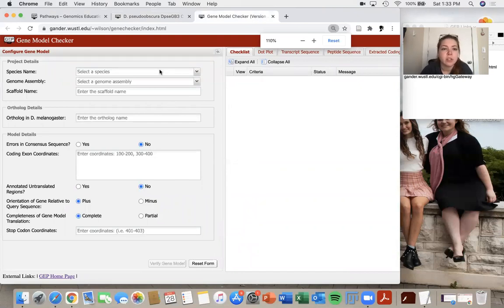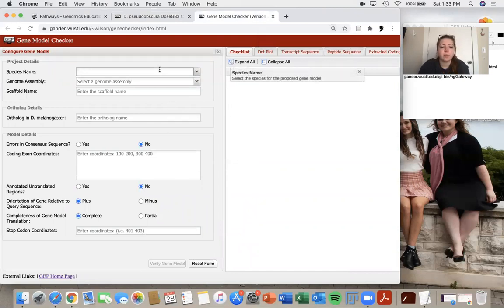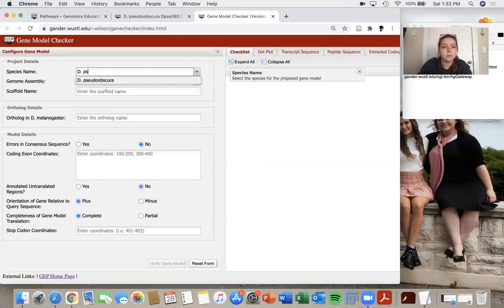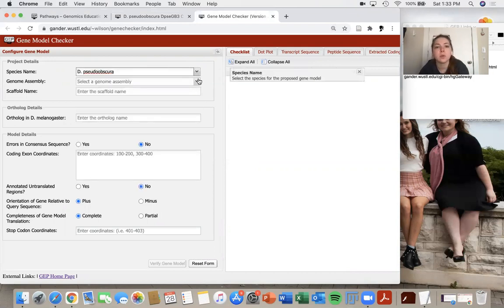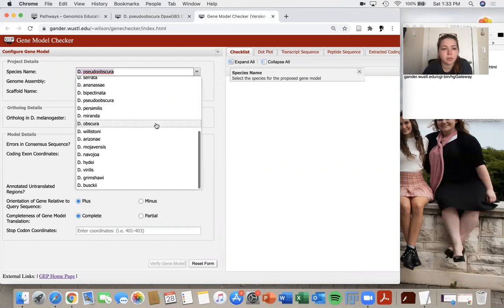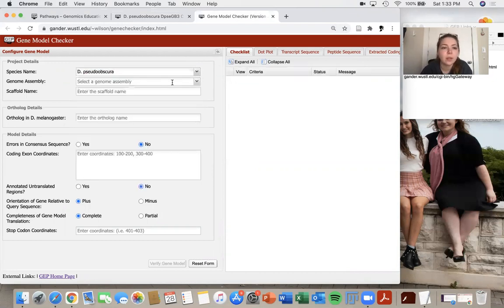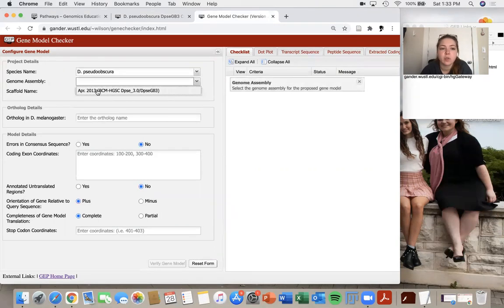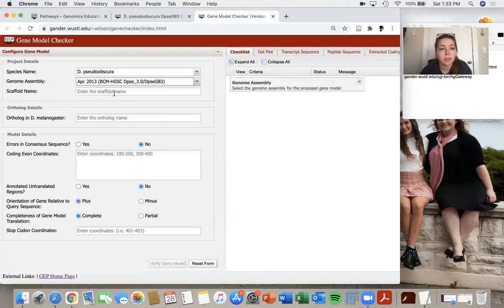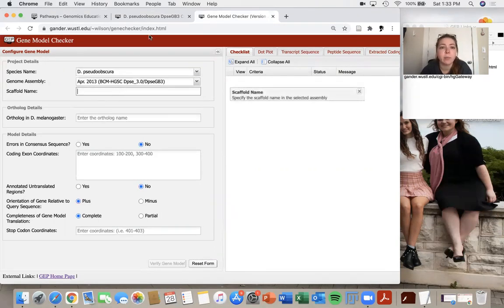So I'm going to select my species. I can either type it in D. pseudoobscura, or I could click the down arrow and scroll through that way. Select my genome assembly. There's only one again for this species and then scaffold name.